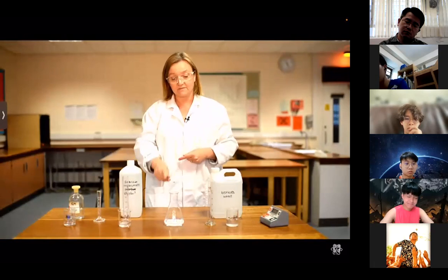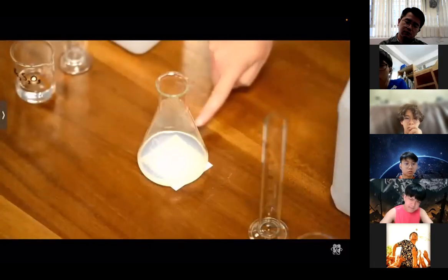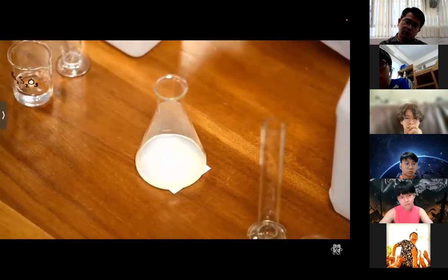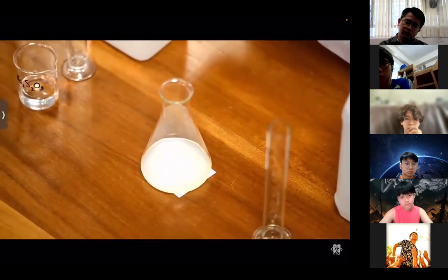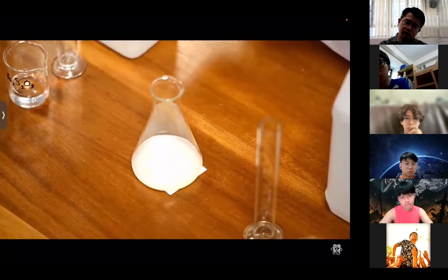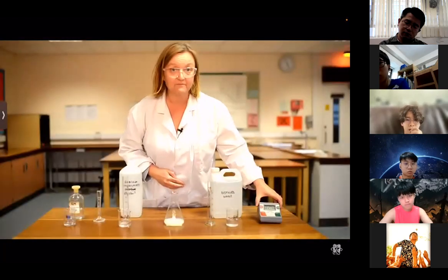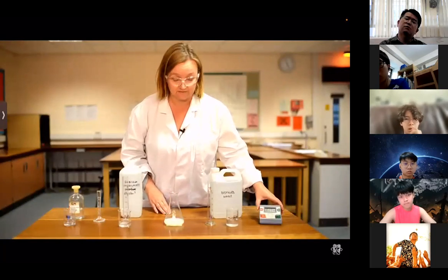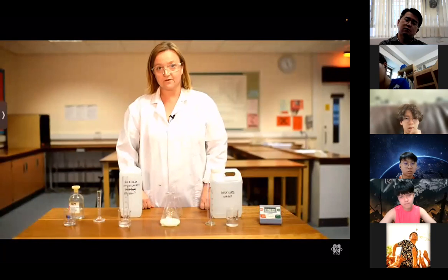After a few seconds, you start to see the precipitate forming and the solution turning this cloudy yellow colour. I'm going to watch from above until the cross has totally disappeared. Now, stop the timer. I've got a time for my first concentration of 27.44 seconds. That was the most concentrated.